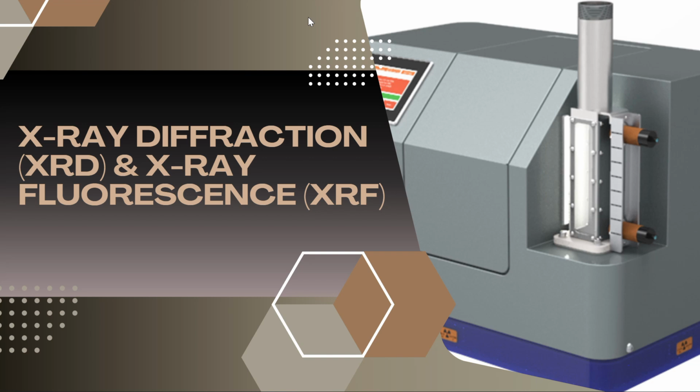Next is X-ray diffraction or XRD and X-ray fluorescence or XRF. These are both X-ray techniques, but for different purposes in mineral and metal analysis.